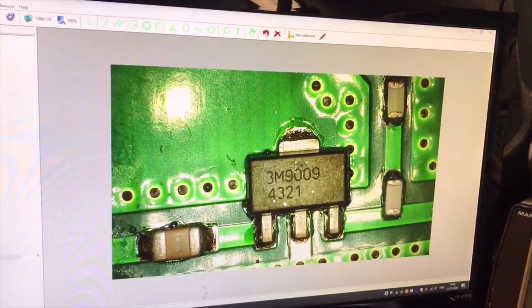And we can now also record, if we go to the left top here, you can make a snapshot, an image, or you can capture some video, but it will be on this lower resolution. But then you have it immediately on your computer and you don't need the SD device. But I really advise to get this micro SD card, because then you can just set it to 12 megapixel instead of this almost one.